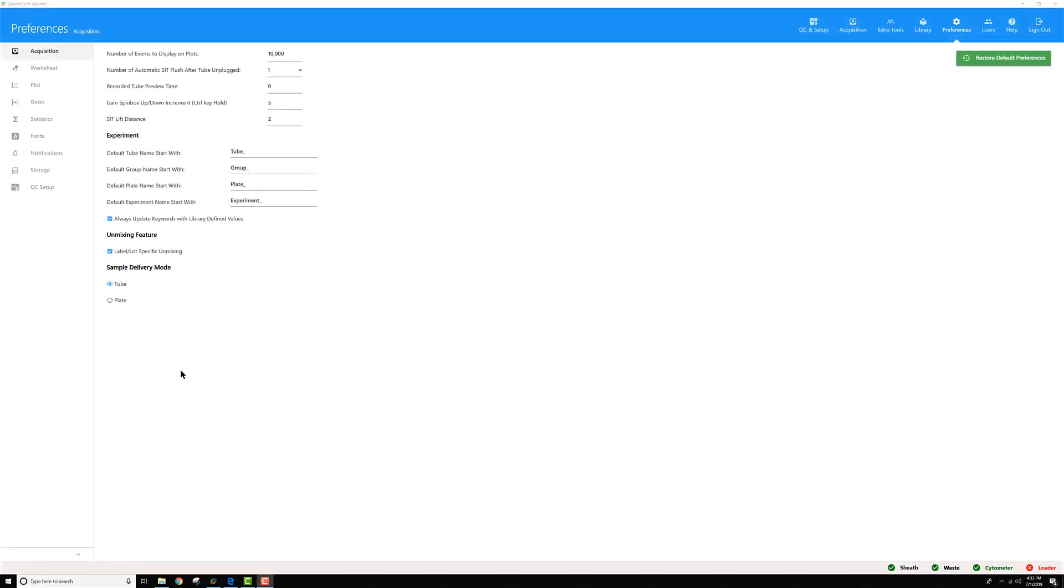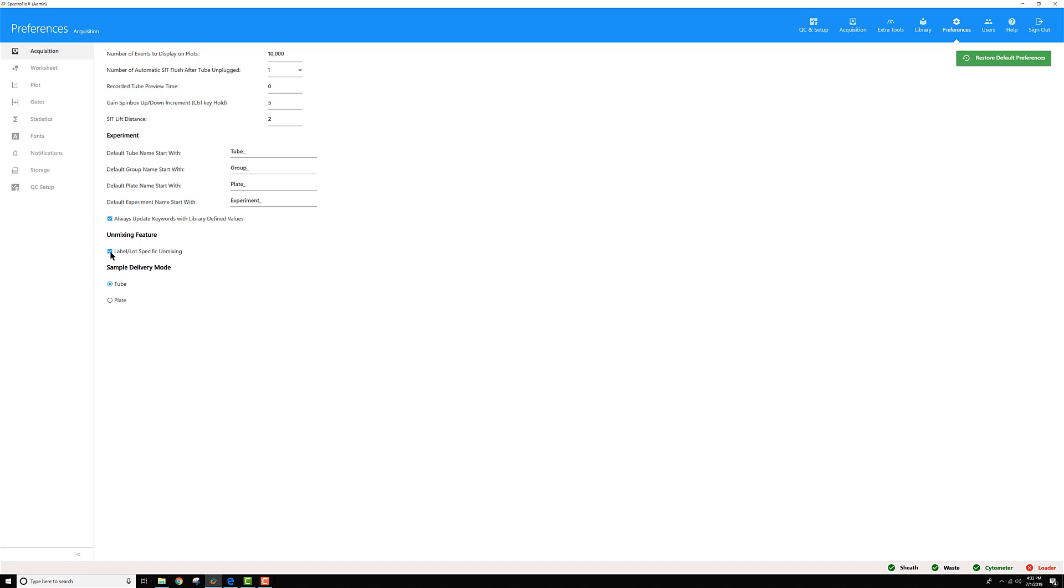To enable label and lot specific unmixing in SpectraFlow software, you need to go to the Preferences module, then to the Acquisition menu on the top left, then go down to the Unmixing feature and check the label lot specific unmixing checkbox.